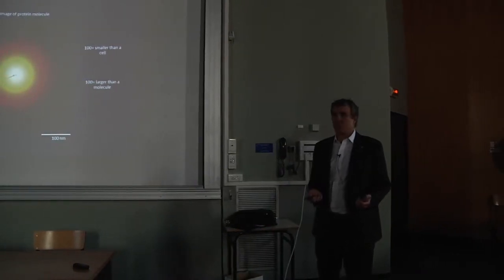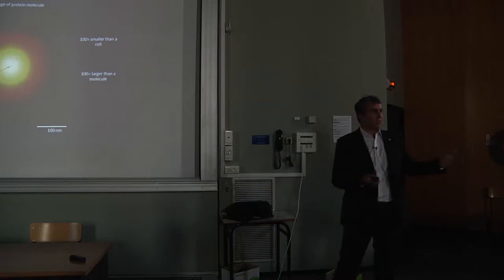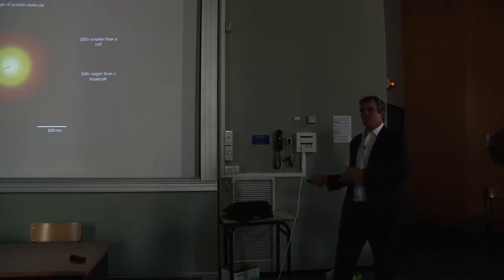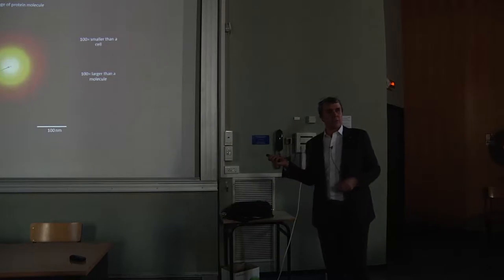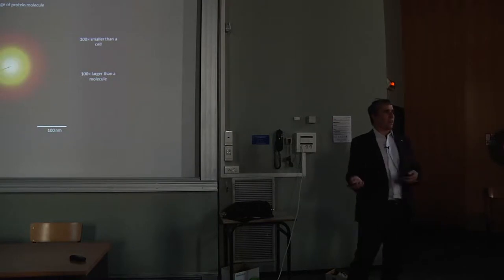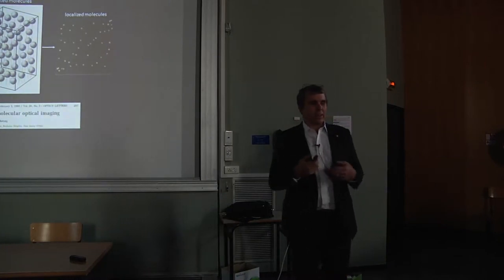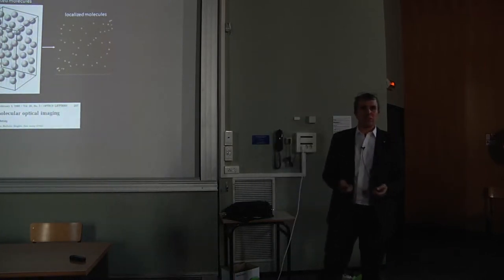So in the first half of my talk, I'm going to tell you about ways to get beyond that diffraction limit. And then I'm going to turn around and talk out of the other side of my mouth and say, hey, wait a minute. There's a lot that we as physicists can contribute to make microscopes better even at the diffraction limit. So I had several forays in trying to do super resolution.